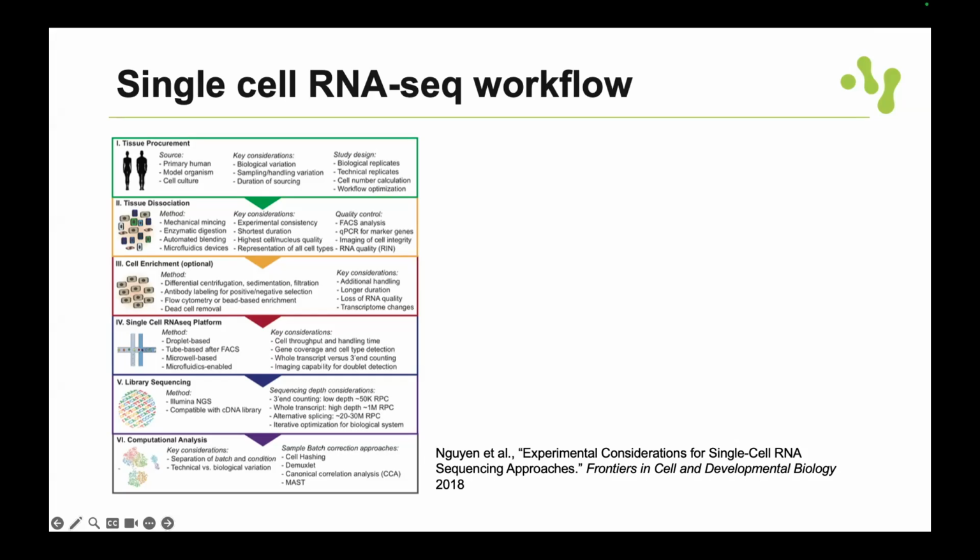So you dissociate your cells, and you check the viability. You don't expect to just plan your experiment, run it, and go straight to the single cell method. It's worth spending time on these before you actually go to the single cell method.